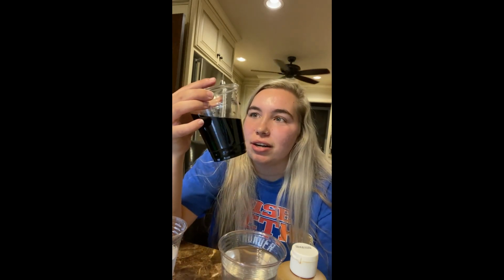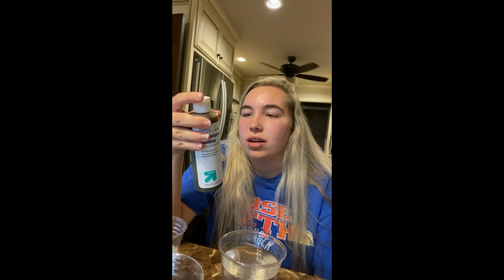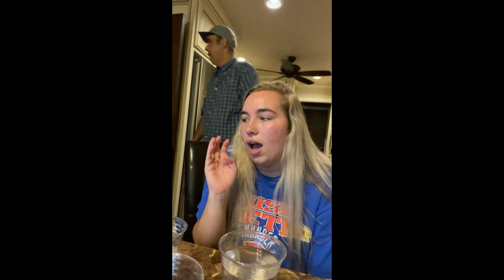As I said before, my color is a bit darker and more brown, and I think there are several reasons for that. One, my iodine solution was a little different. This was all they had at the store when I went to get it, and I don't believe it's as pure, and it's a different concentration than he used.